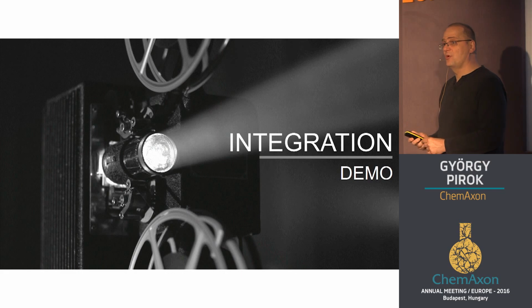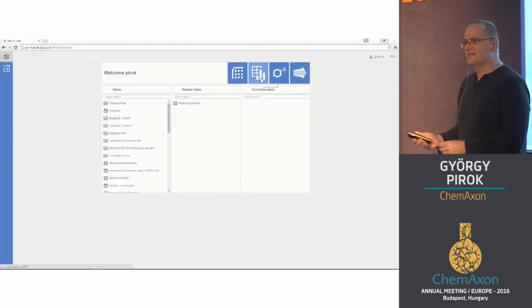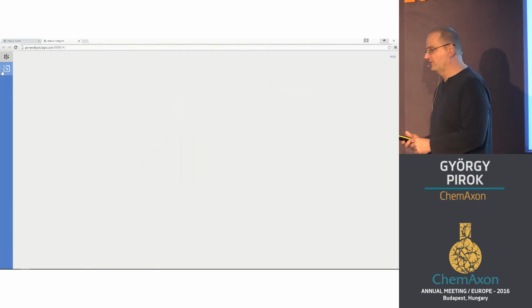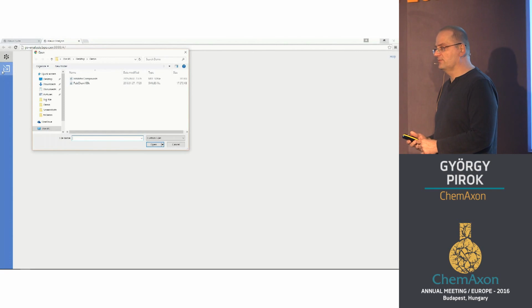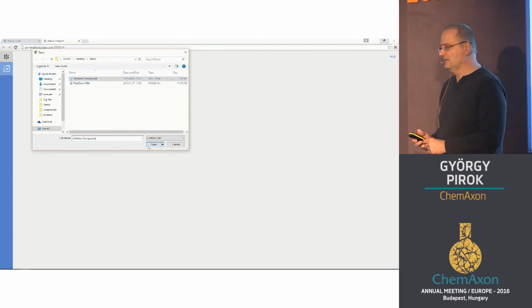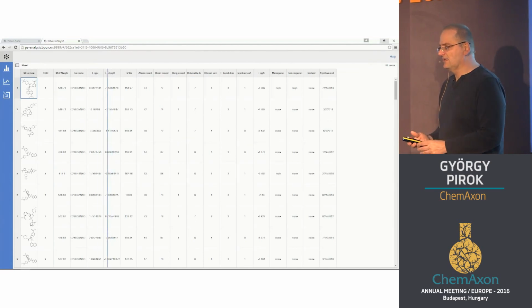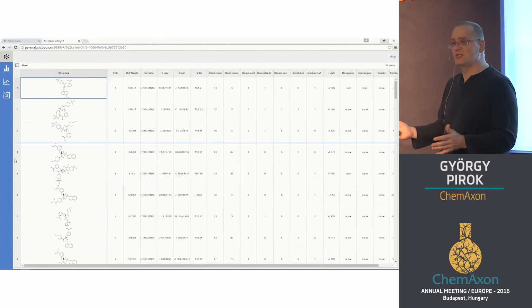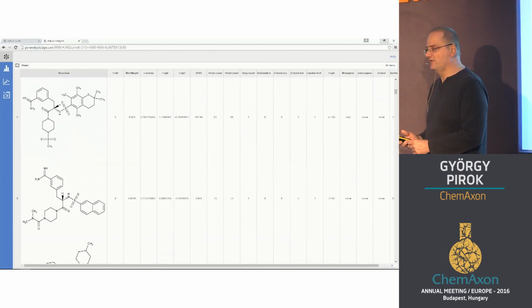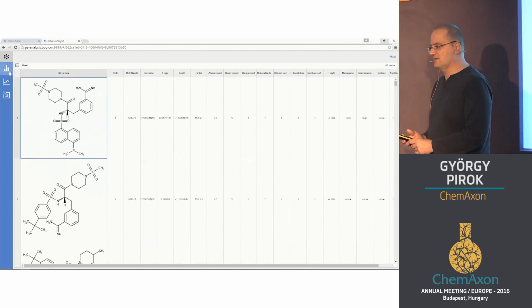And I would like to show you how it looks and how it works. You may realize if you recently saw Plexus Connect that it has a temporary dashboard. And from the dashboard, we started Plexus Analysis, and we can import a file as the most basic data source. And here we see a kind of spreadsheet-like component. We are not in a database. It loads on the server. You can see the chemical structures and additional data.